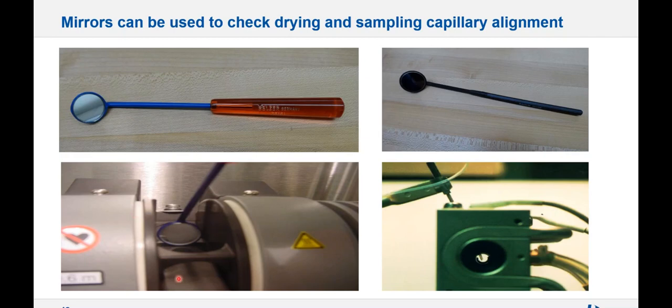So drying is extremely important. Pyrolysis is important as well. You want to make sure the temperature is not too high. And with that, you would do a pyrolysis study through the software. But drying always needs to be checked on your standards and on your samples.